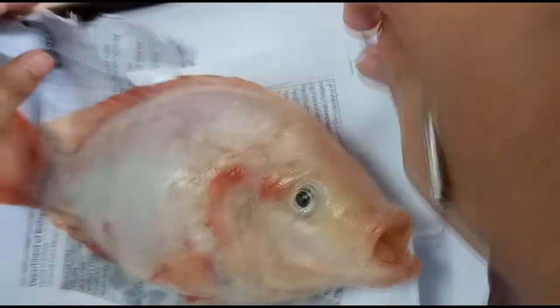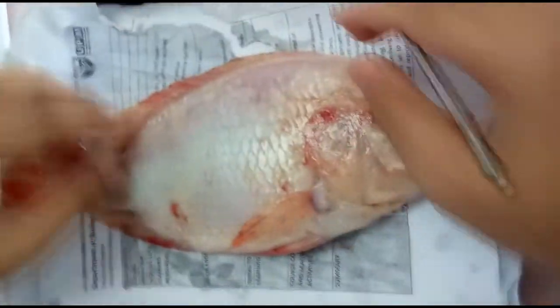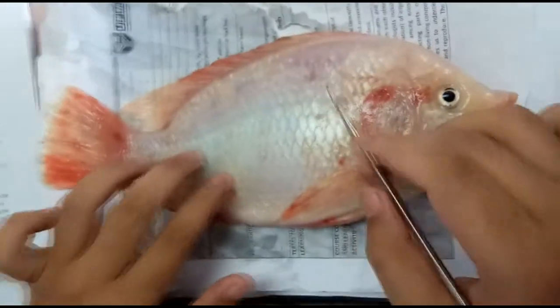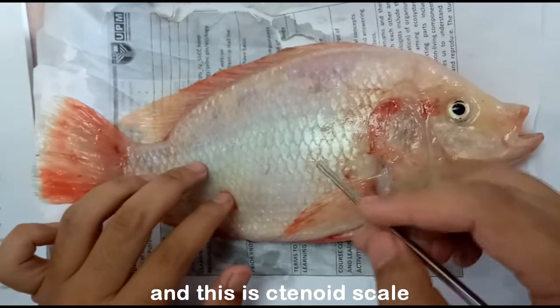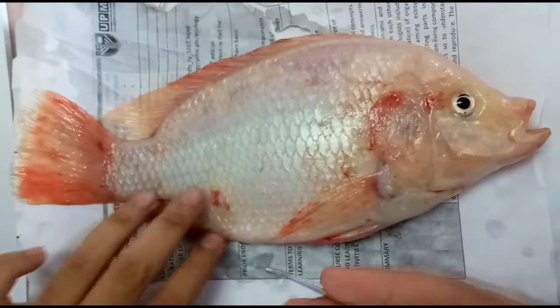Alright, so now let's continue to the trunk part. Okay, now the trunk part, as you can see, there are a lot of scales here. The scale is a type of scale, this is the ctenoid scale. You can see it like this.